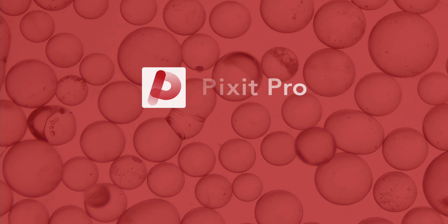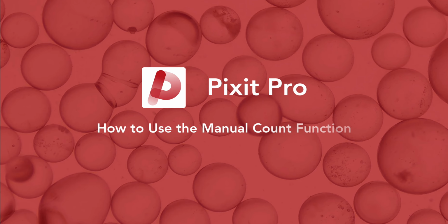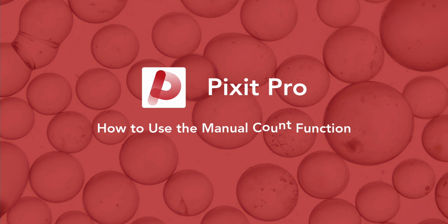Welcome to Pixit Pro. In this quick tutorial, we'll show you how to manually count particles in your sample.